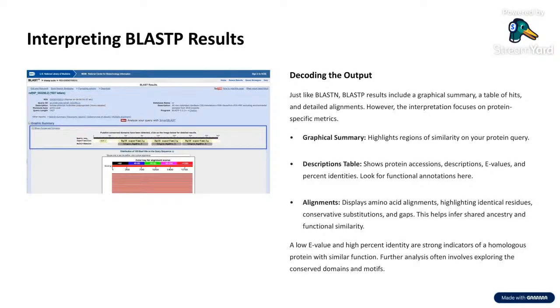After that, the result will show the protein level alignment between the translated form of both query and database. That hit might be completely missed by BLASTN or BLASTX due to DNA divergence. It is especially valuable for cross-kingdom or gene studies. Basically, between BLASTX, TBLASTN, and TBLASTX, the main difference is query type.